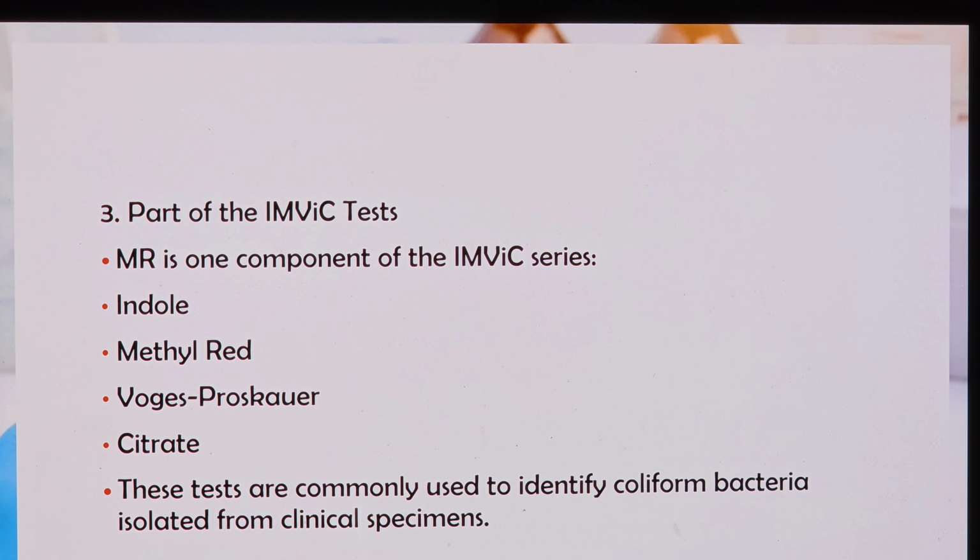Part of the IMViC test. MR is one of the most important IMViC series. For example, indole, methyl red, Voges-Proskauer test, citrate test. These tests are commonly used to identify coliform bacteria isolated from clinical specimens.